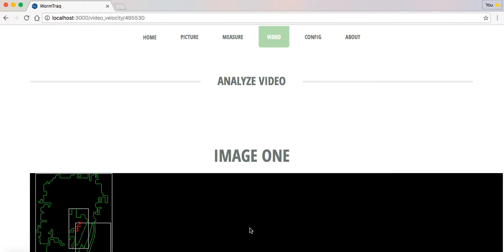That's really it. And again, I didn't show you the other feature in the video section, but that takes your video or snapshot and does image processing.